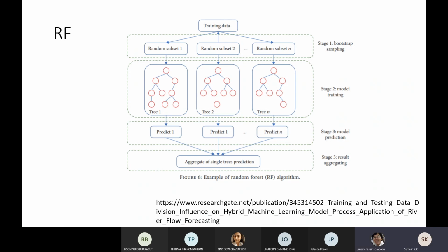Please say again. You said this aggregate is for only one sample. For example, if we make the model using random forest, and then we have the model separate, and we want to know an unknown sample, what is the classification of this sample?